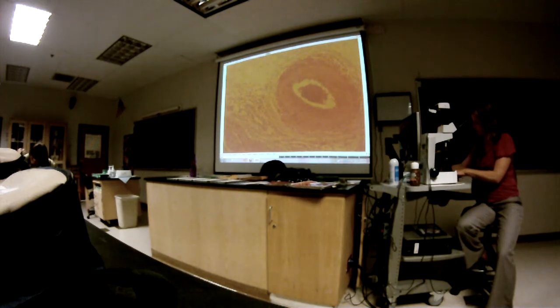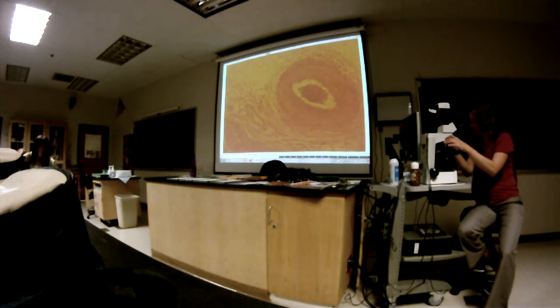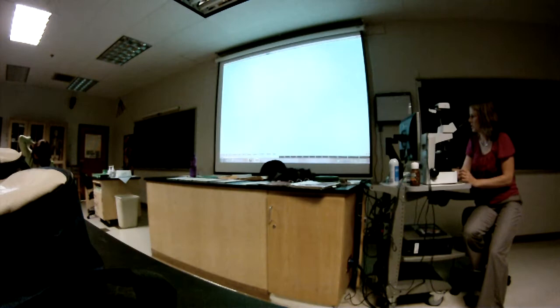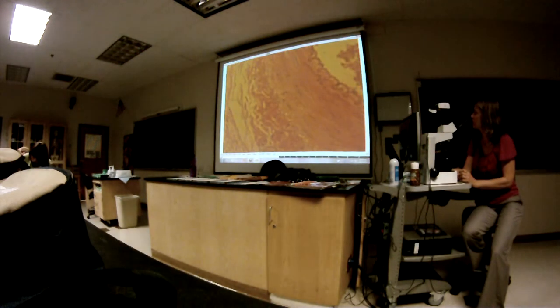Okay, I think we're good with the blood vessel. Any questions about that one? Is it simple squamous for the leukocyte? Yes, it's simple squamous. The endothelium is simple squamous lining. Maybe we'll just take a quick closer look.